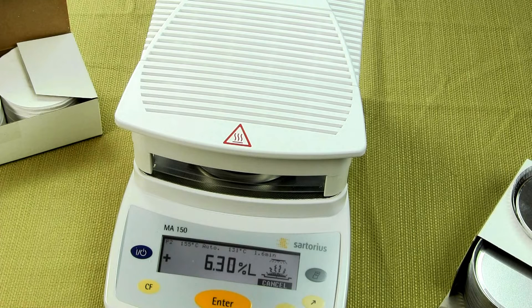We've already covered the pan — it's a standard 90-millimeter pan. For time, we can set anywhere from 0.1 minutes to 99.9 minutes. You can store up to 20 programs. Many other moisture balances on the market have just one profile, so each time you'd have to go and reconfigure it. With the MA-150, you can store up to 20.